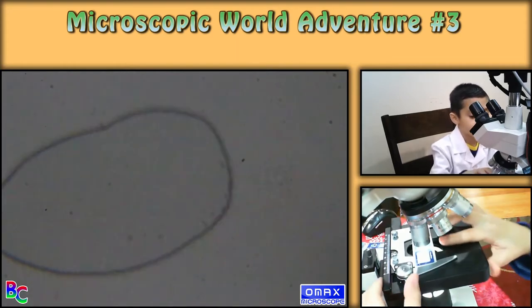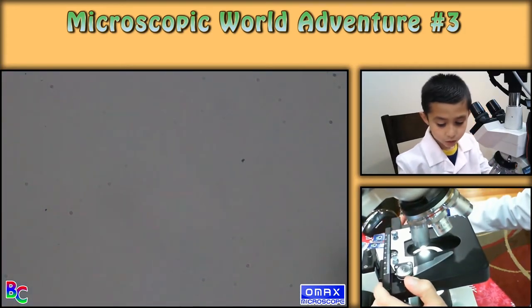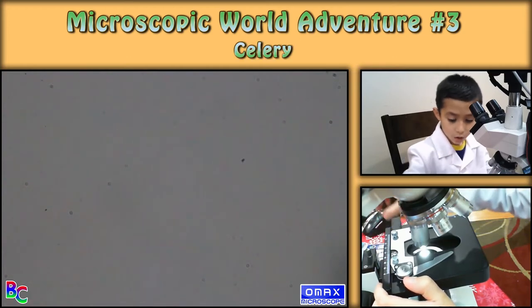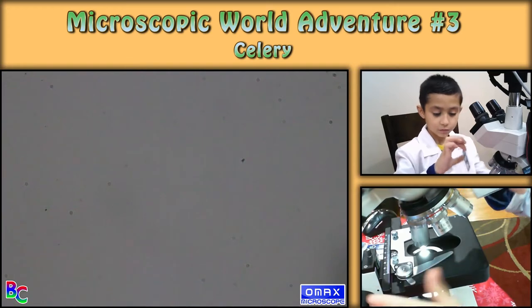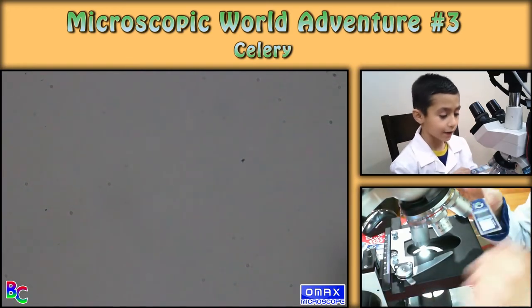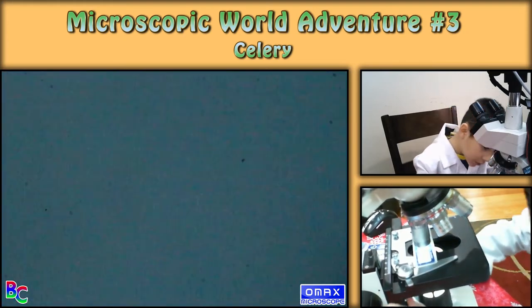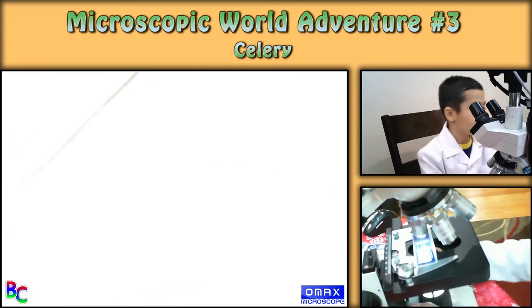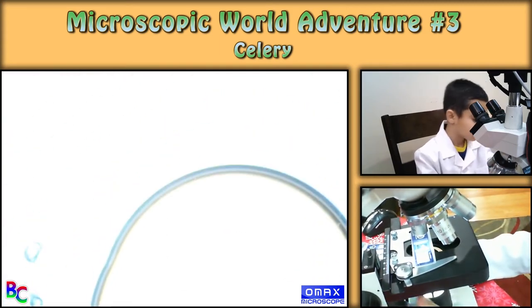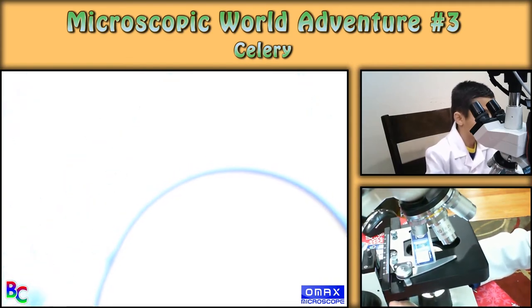Okay, so we're moving on to number four, which is celery. Just one more until the mystery. So my dad put — I'm guessing — ink on this one because it's blue. Okay, I need less light.